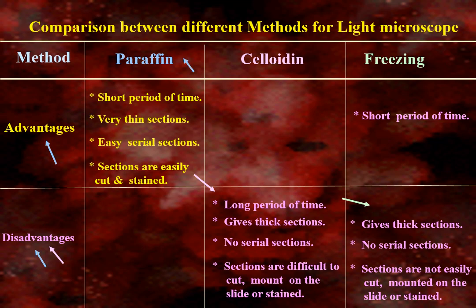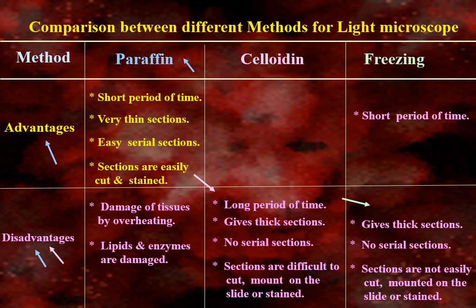Disadvantages of the paraffin method are damage of the tissue by overheating. Lipids and enzymes are not preserved. These disadvantages are advantages in the other methods.